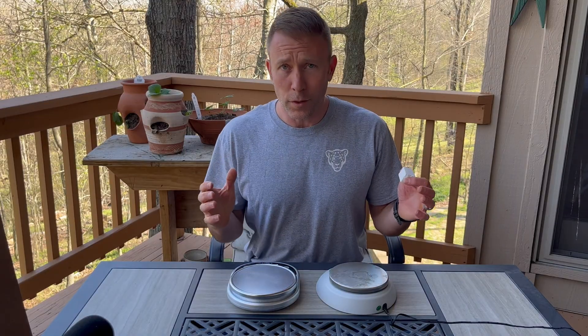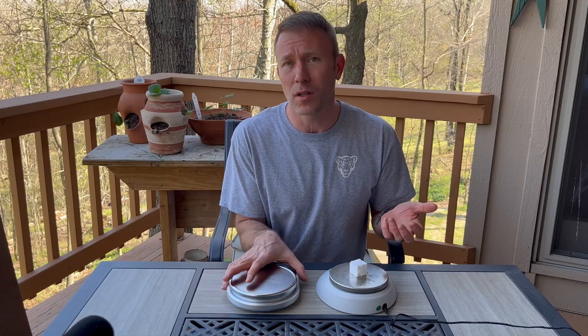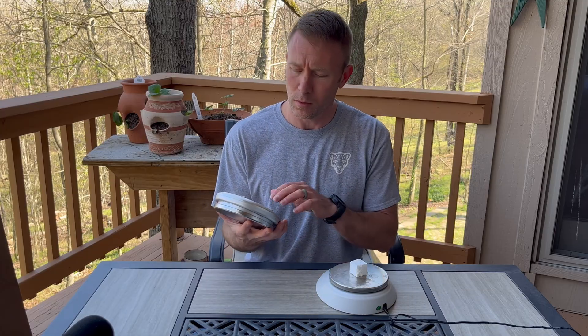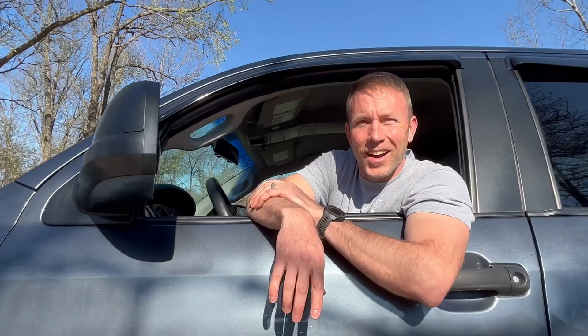Finally, it's worth mentioning that these digital scales are only rated for certain weights or masses. Something that's super light may not even register, and something that's super heavy will certainly destroy it. You may want to check the instruction manual or the back of the digital scale to see the rating for that particular instrument.